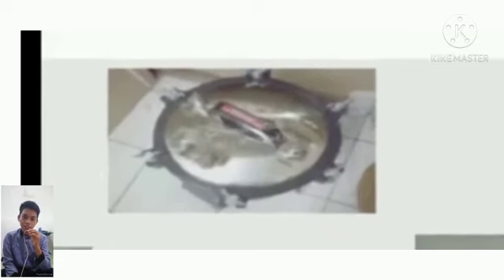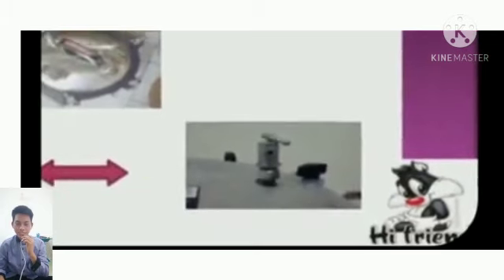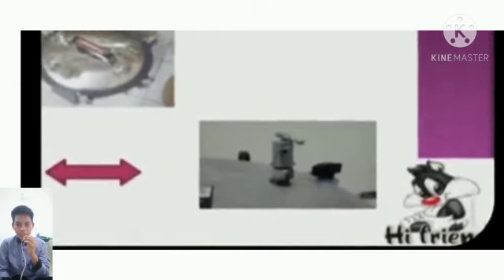This is a picture of the gas pressure meter. The pressure indicator is one component that needs to be considered when using a manual type autoclave. The shape is in the form of a glass tube with a needle. This is a picture of a pressure plug, used to remove excess hot steam.